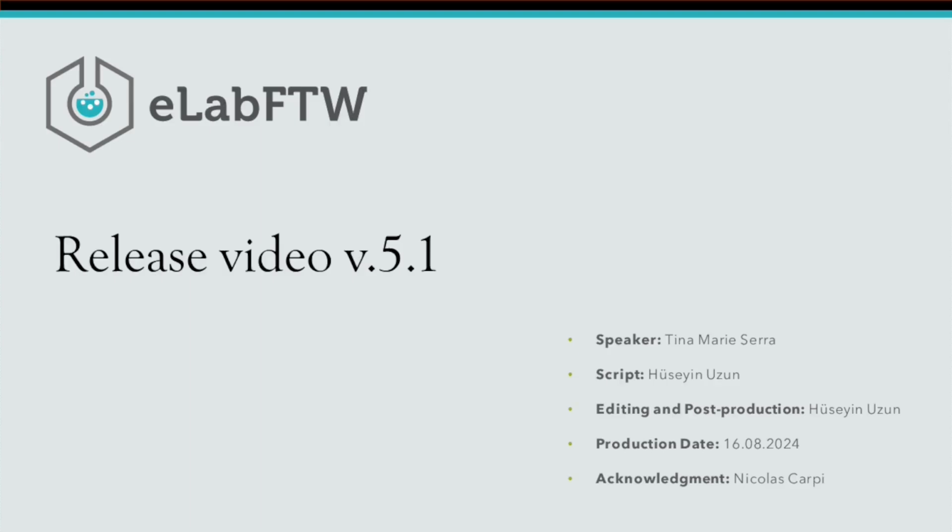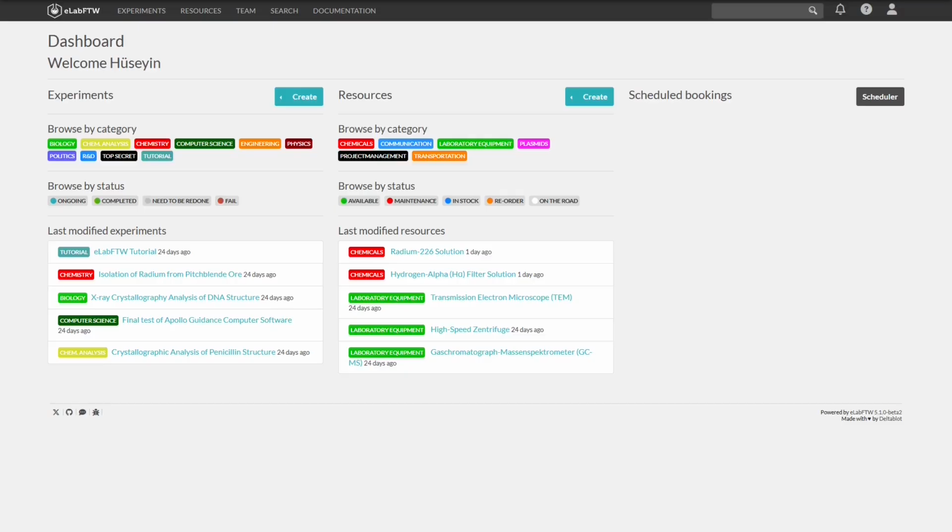In this video, we will show you the newest features released by version 5.1. Let's start right away. We are already in eLabFTW on the dashboard.